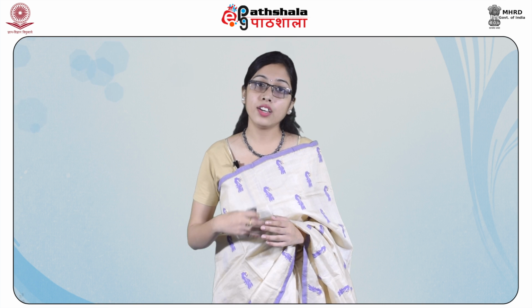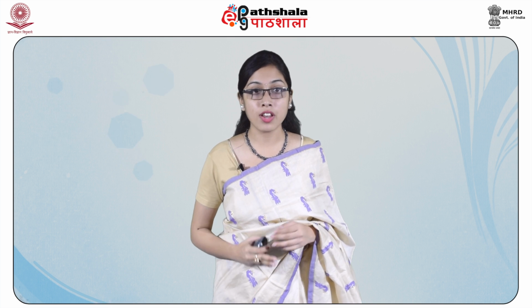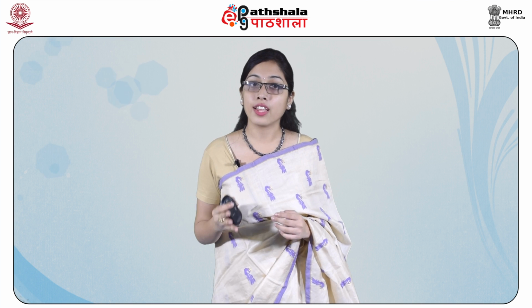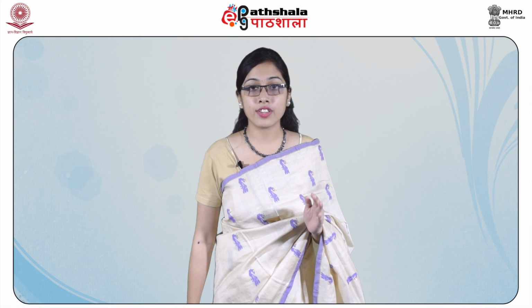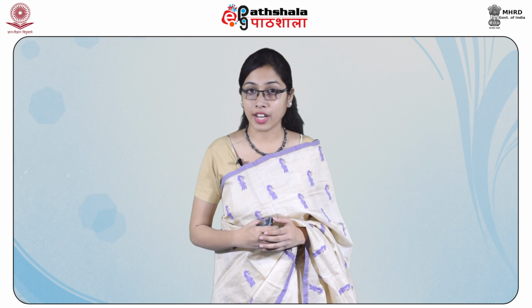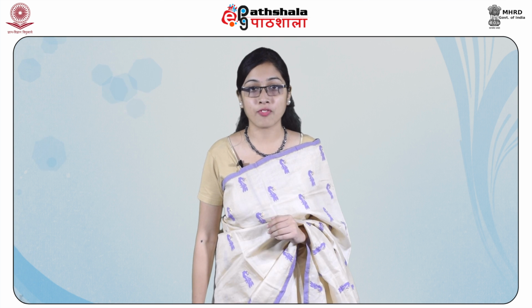of material. The equipment for paper chromatography consists of a vapor-tight glass chamber with inlets for addition of solvent in addition to supports for solvent troughs and chromatography paper. In paper chromatography, a volatile solvent is used to carry the components of the sample along with the paper. This is called the developing solvent. The choice of solvent depends on the chemical nature of the material to be analyzed and needs to be optimized for every type of mixture.